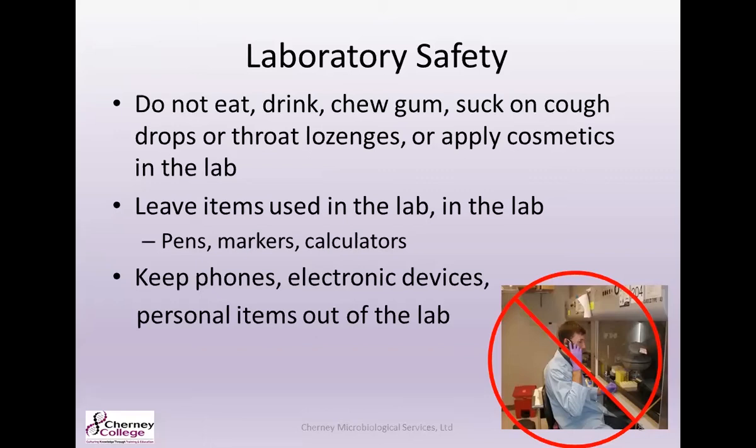Keep your phone out of the lab. You want to make sure that you're not taking any pathogens home with you. And cell phones have over 25,000 bacteria per square inch, dirtier than a toilet. So you don't want to risk bringing in any other bacteria or potentially contaminating anything in the lab. So it's just best that you keep phones and personal items completely out of the lab.